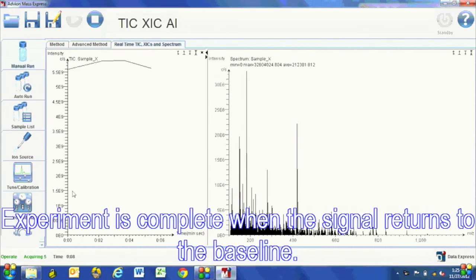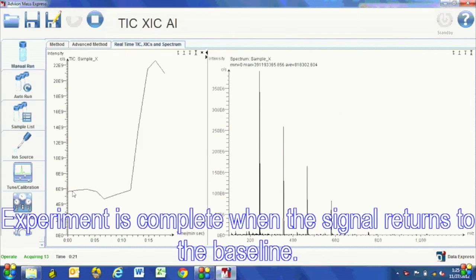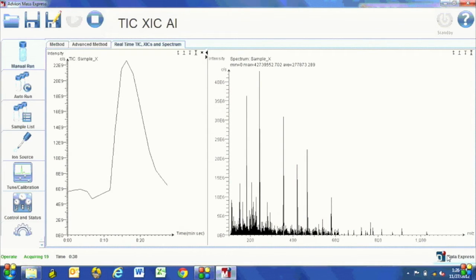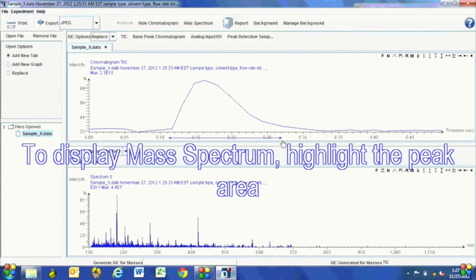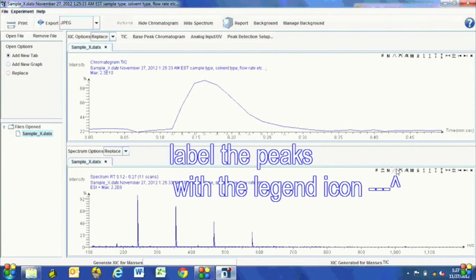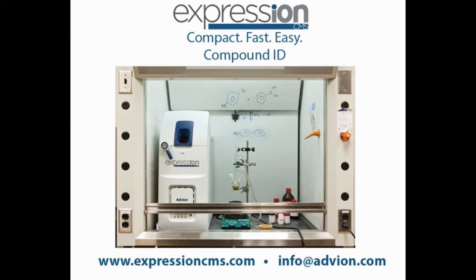The experiment is complete when the signal returns to baseline. To process your data, highlight the area below the x-axis of the TIC.